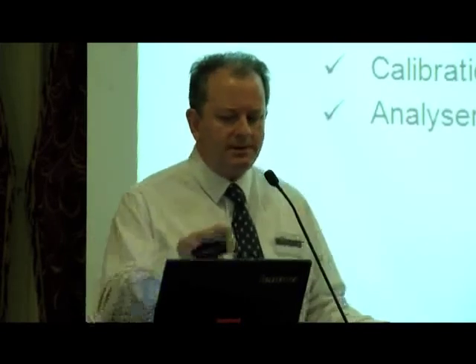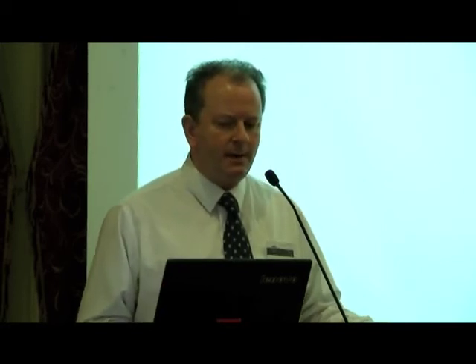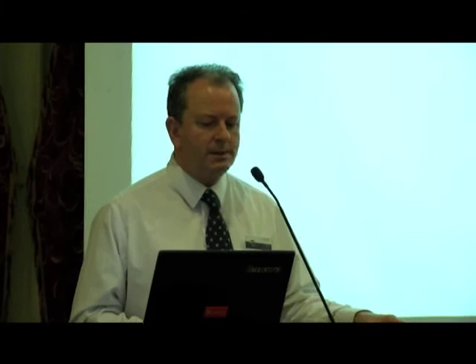So first, let me look into these aspects of the analyzer. First of all, we demonstrate that the user requirement specification, the requirements for the analyzer, are met through the installation qualification and operation qualification. Then, as I mentioned, the performance qualification will allow us to establish the frequency of recalibration for this analyzer.